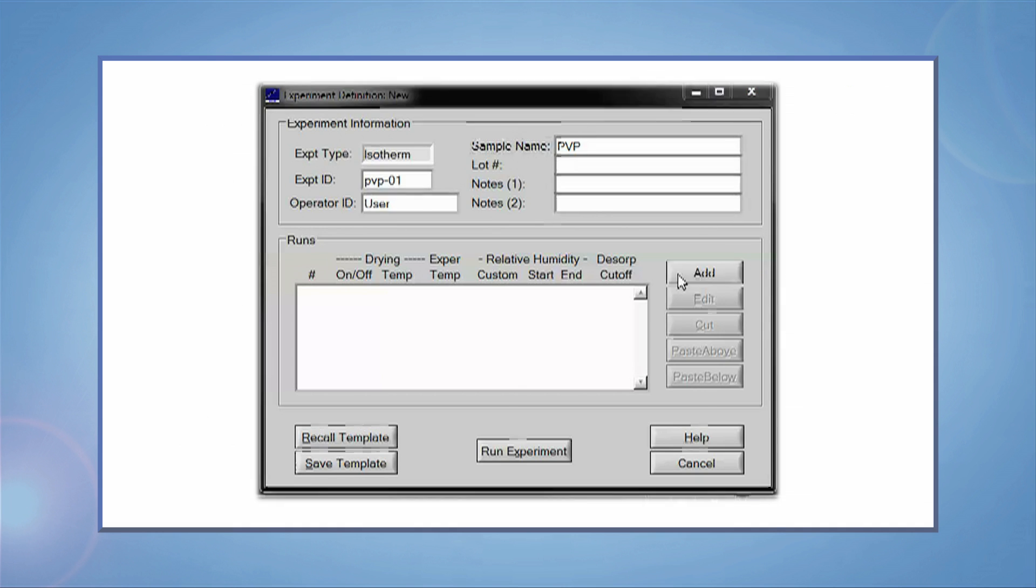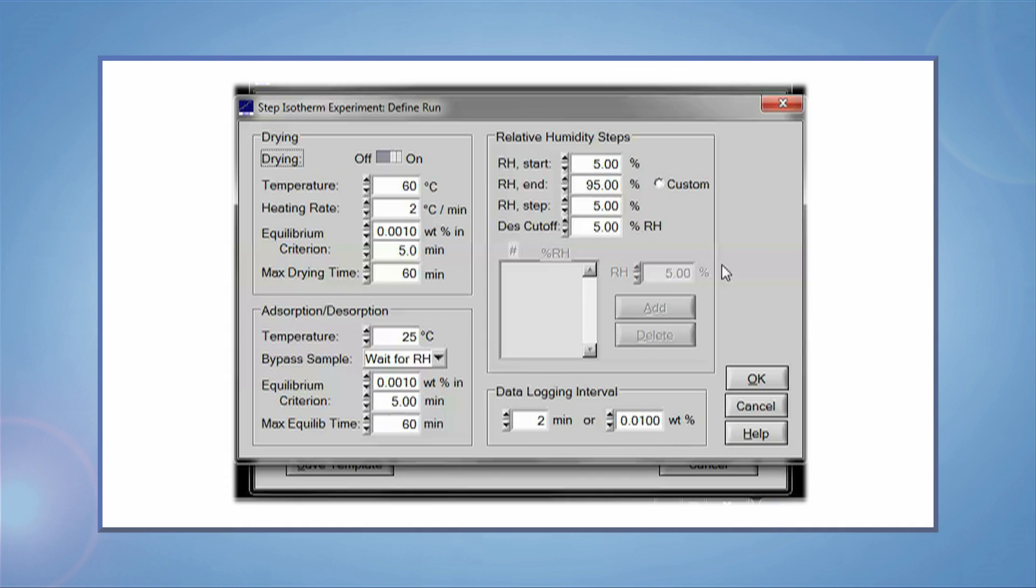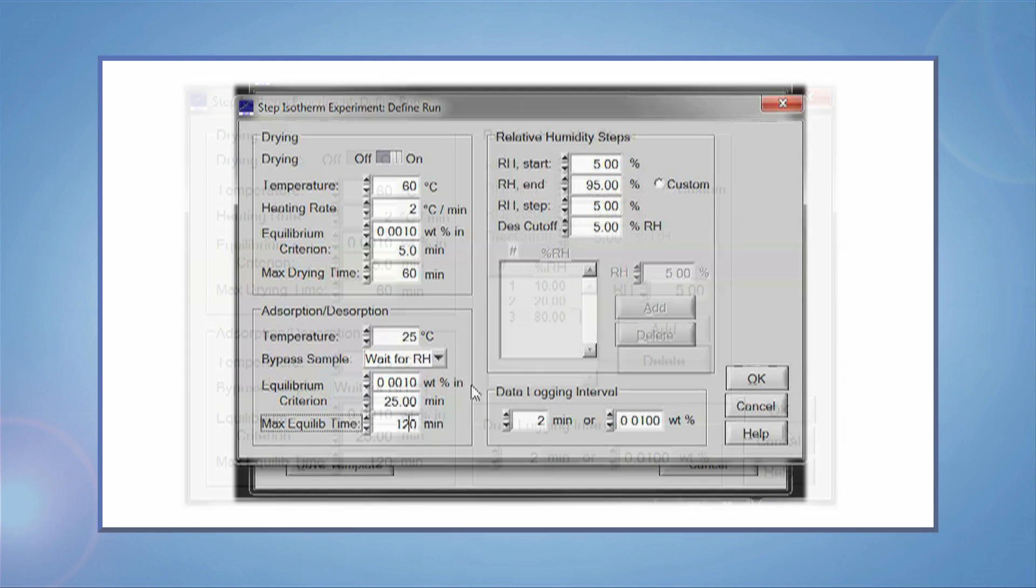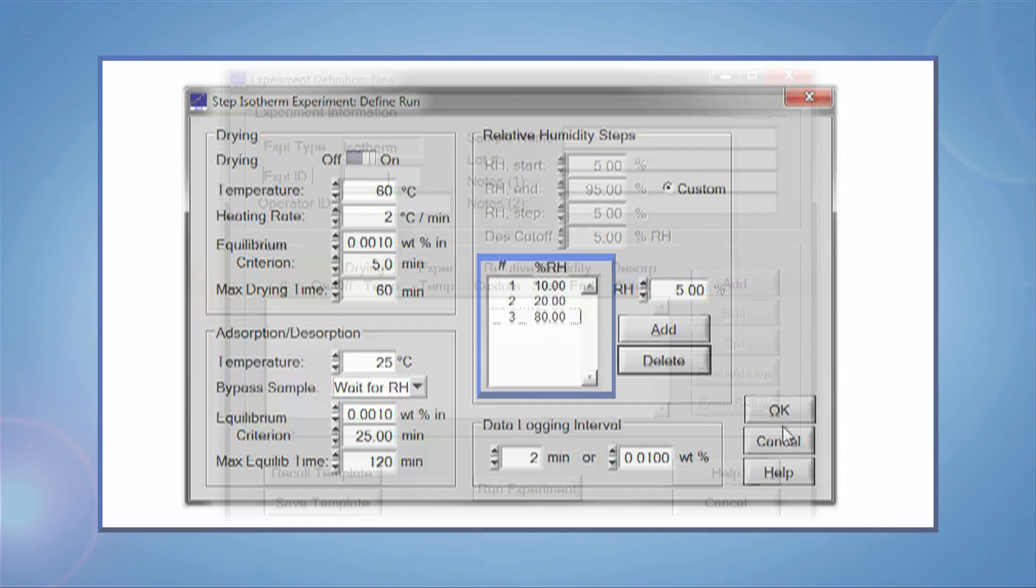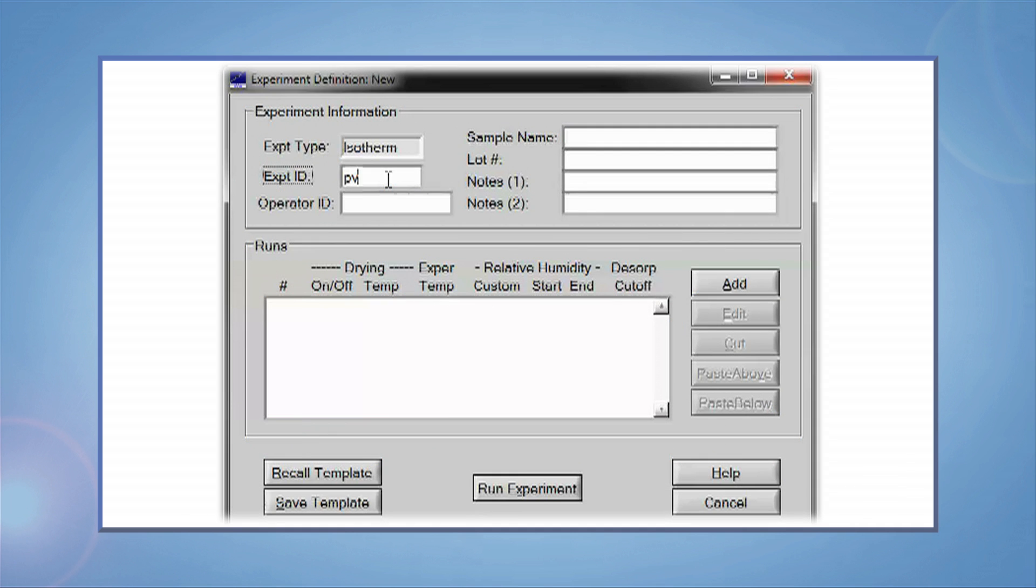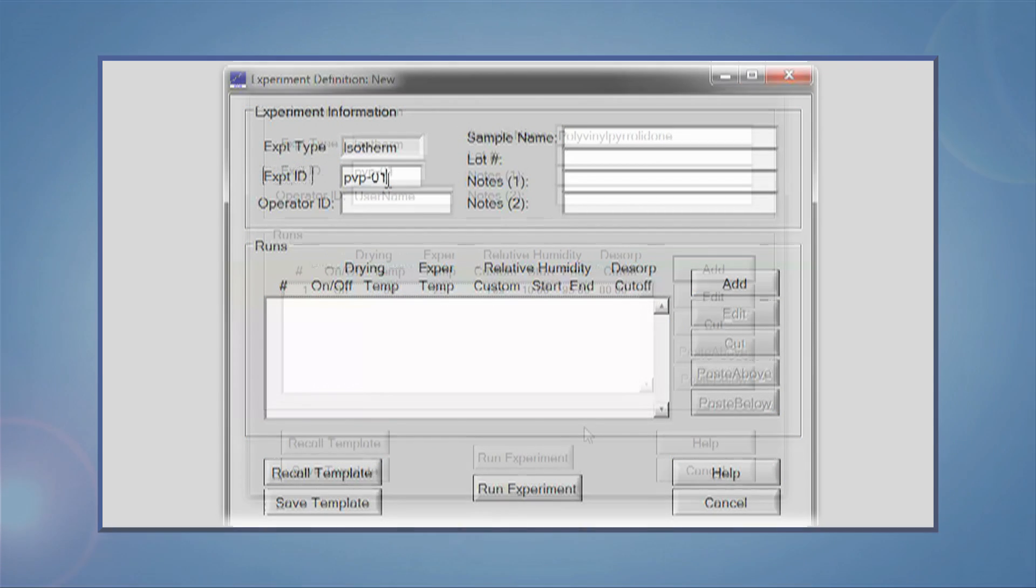Click Add. Enter all the settings as shown on screen. RH steps are 10, 20, and 80%. Click OK, enter an experiment ID, which will be used as a file name, then click Run Experiment.